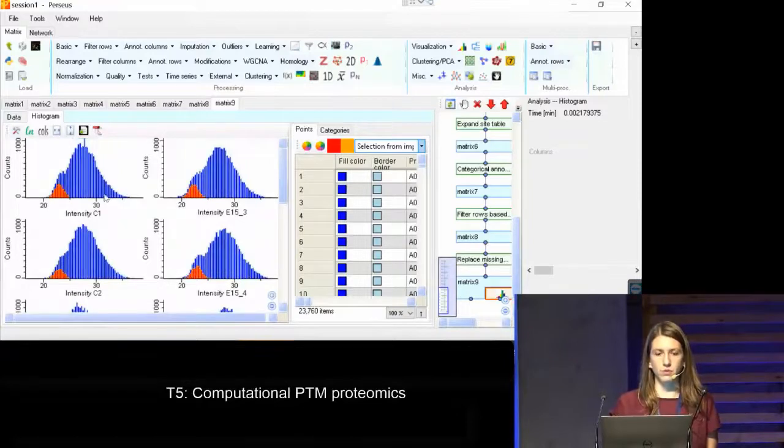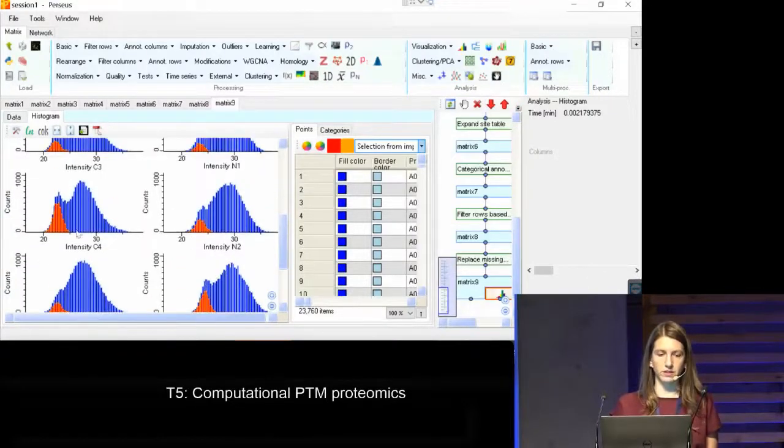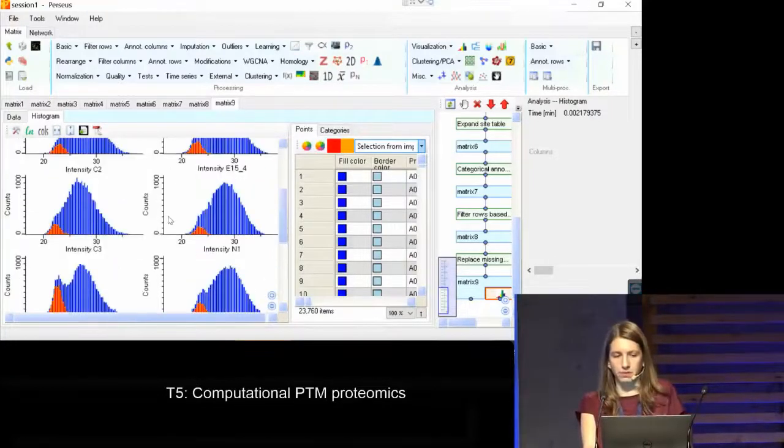As a rule of thumb, you don't really want to create a second peak, and you also want to stay somewhat within the main distribution. So it should not be a distribution that is lying completely separately from your main distribution. In this case, it's something that we could accept. Now, if you look at all of this, you would see that there are some cases that do not look quite nice. But again, if you go into the data carefully, you would see that these are some of the samples that have more missing values. And then you would expect this to happen.